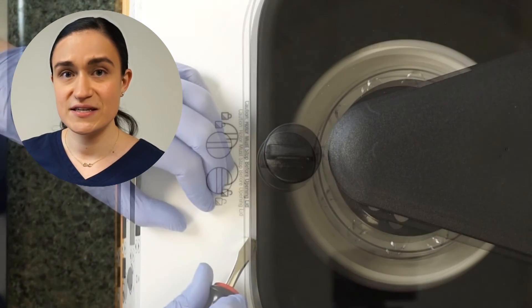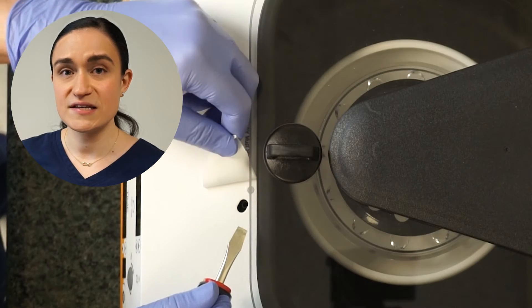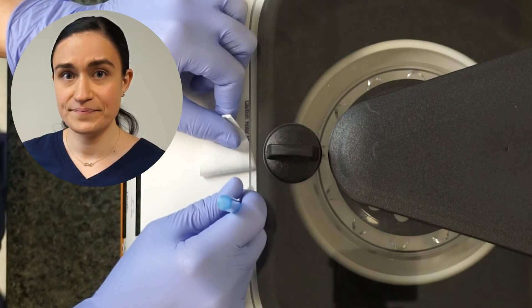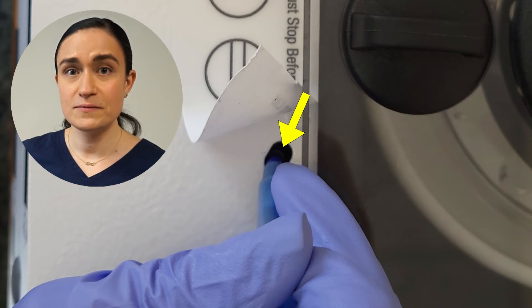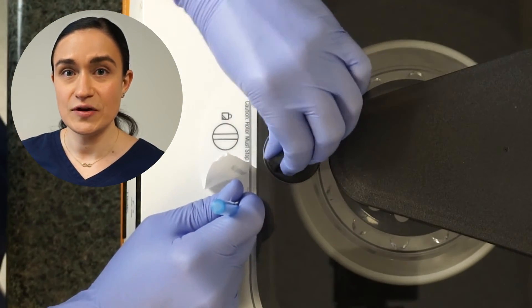Using a flat object, peel this sticker up. Underneath, you will see a small hole. Using a pointed object like a pen, insert the tip into this hole, press down and pull back towards you. You will hear the lid lock disengage and then you'll be able to open the lid.